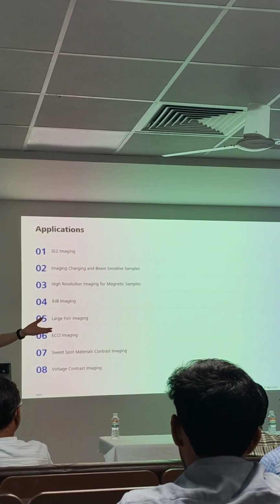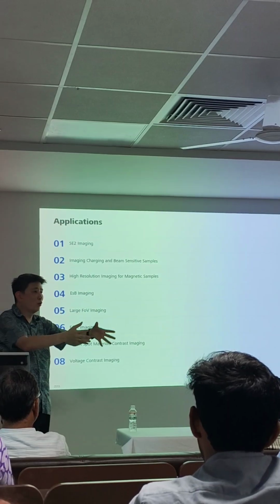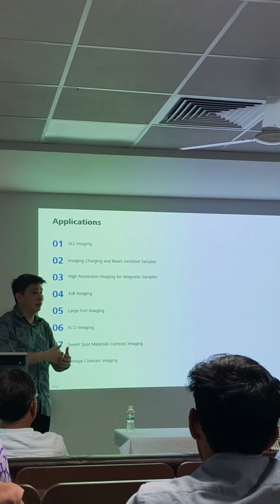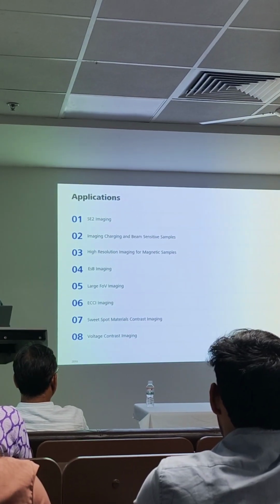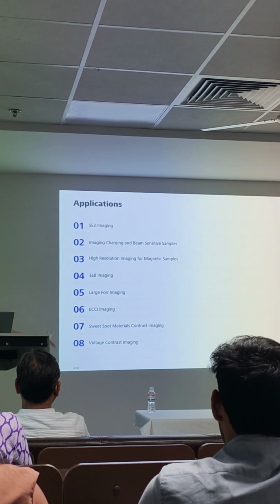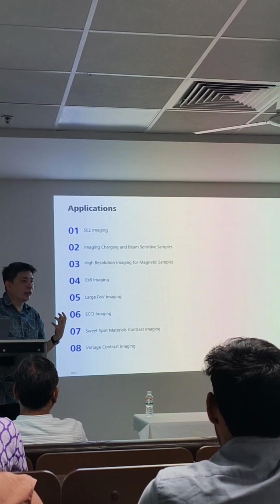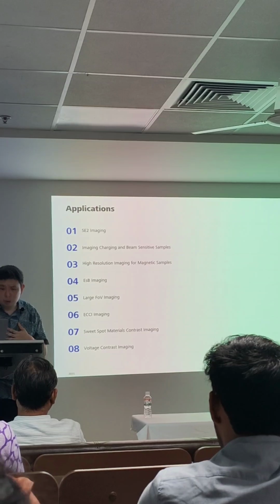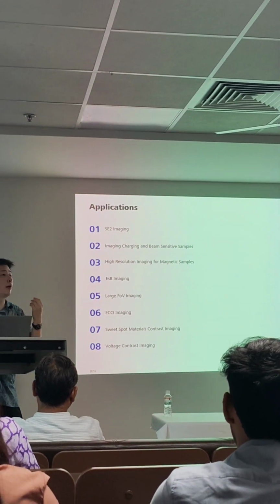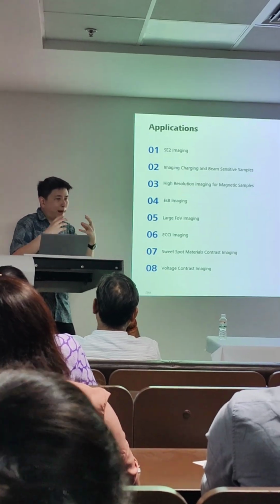We can even do half the group on the machine and another group we can discuss things. Okay, so I'm going to go through very fast here, different pictures, different things. Most of it I personally took on the machine, and I hope it will inspire you when you review a paper publication.